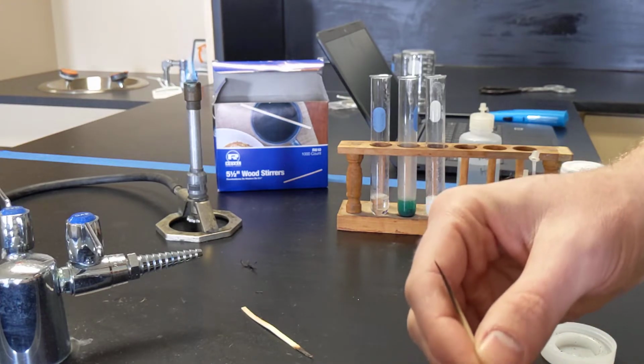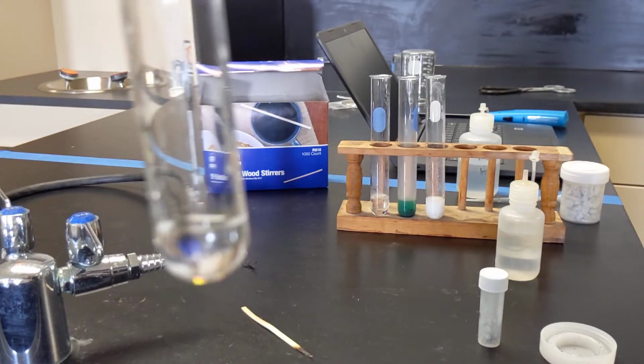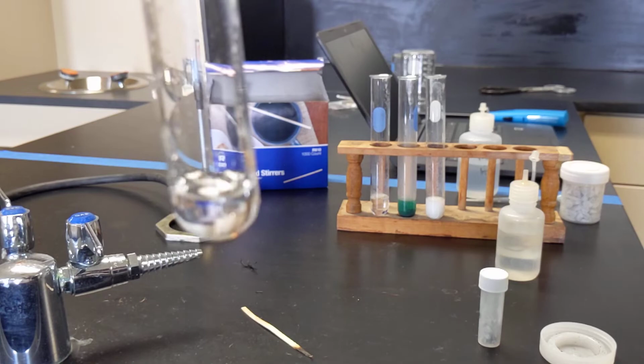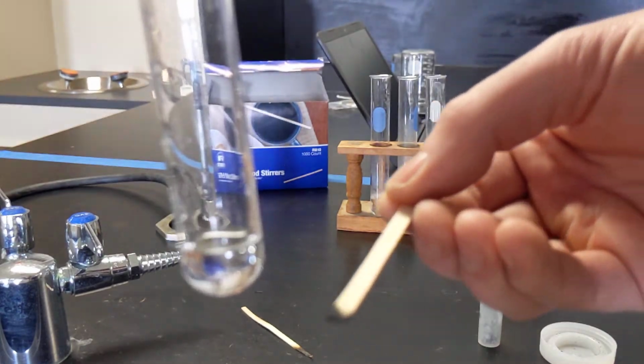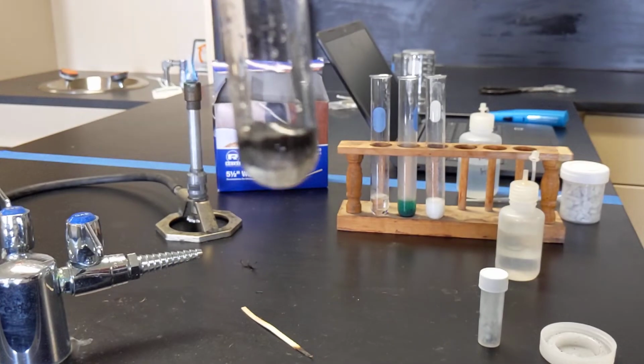This is a catalyst, and what the catalyst does is it allows the reaction to happen faster and at lower temperatures. So the catalyst, the black powder, is at the end there. Put a little baby bit in there.